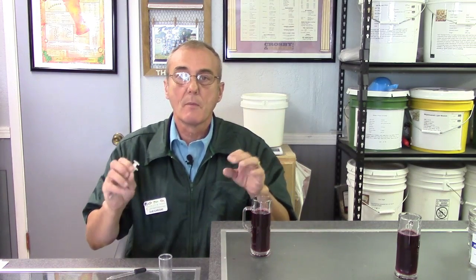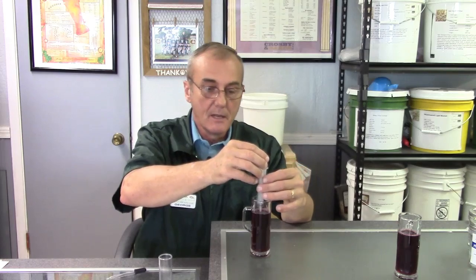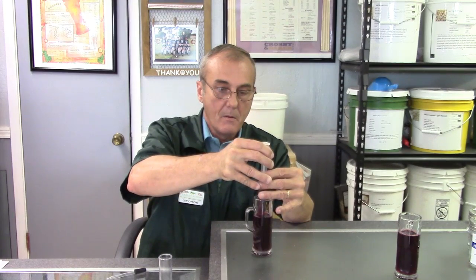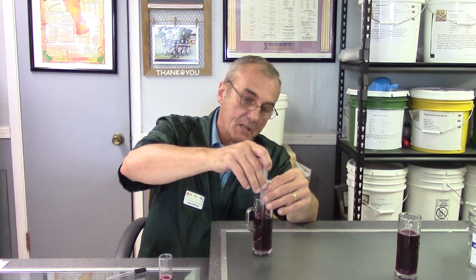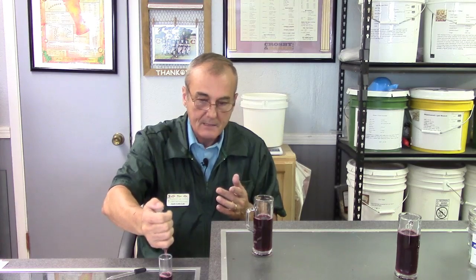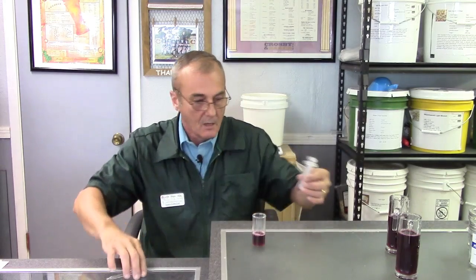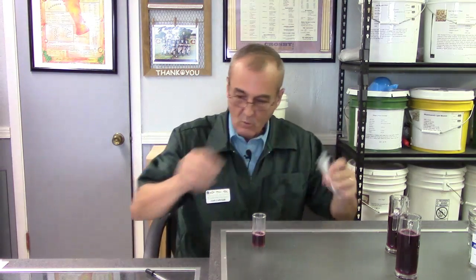We also have phenolphthalein — another chemical, be very careful, it's also dangerous. We're going to use these to test the acidity of the wine specifically. You can test white or red wines — it's all about a color change. The first thing we do is take 15 cc's or 15 ml's — both scales are the same — and put that into our test beaker. There's 10, and now let me get five more.